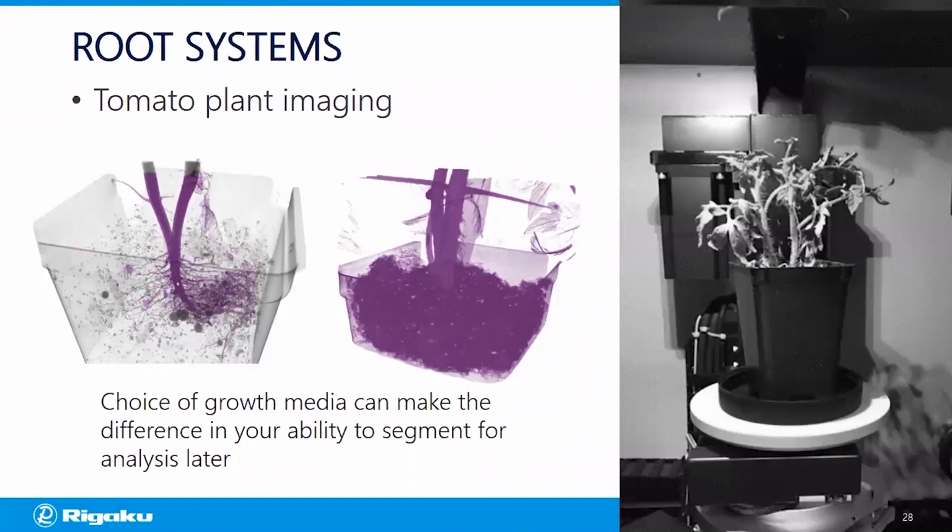So this experiment identifies the peat mix as a better growth media for CT imaging and makes life much easier for later root segmentation. And it turns out there are wide choices of growth media for plants, but this simple experiment illustrates an example where soil is a consideration and you can explore it and exploit it using CT methods.